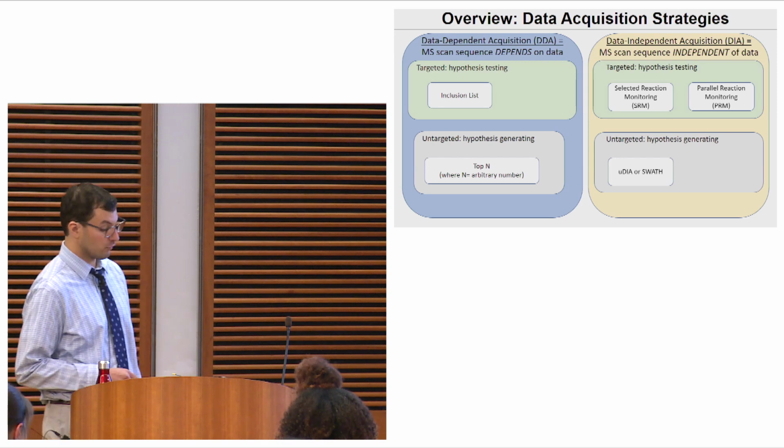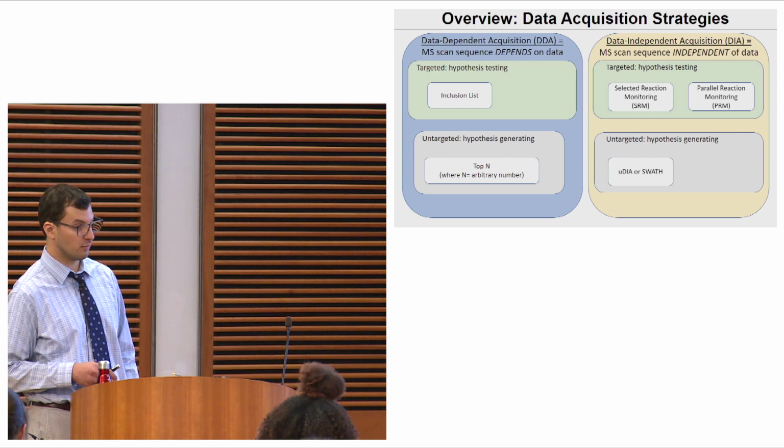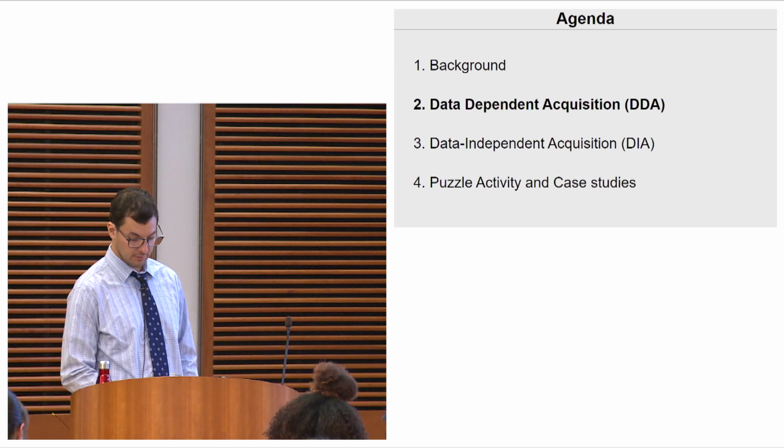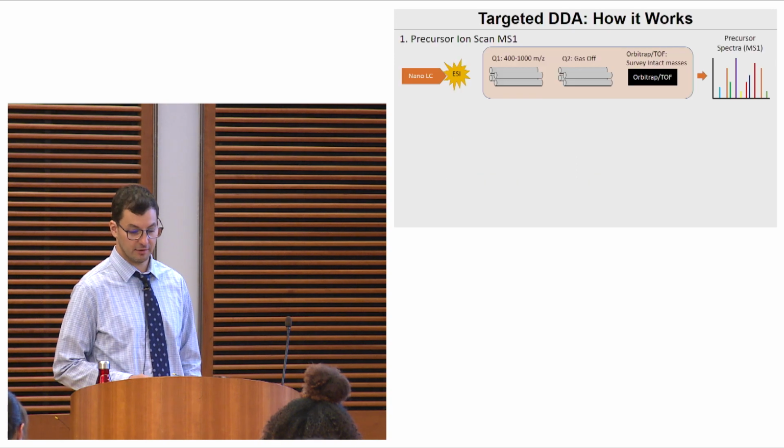Now, this slide gives you an overview of all the topics that we'll cover for the rest of the presentation, so I realize it might be overwhelming right now, but I'll explain each of these concepts in more detail, starting with data-dependent acquisition, and specifically targeted DDA.